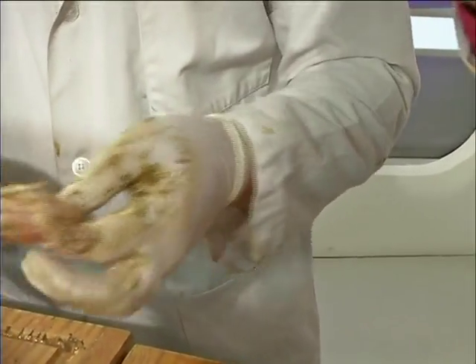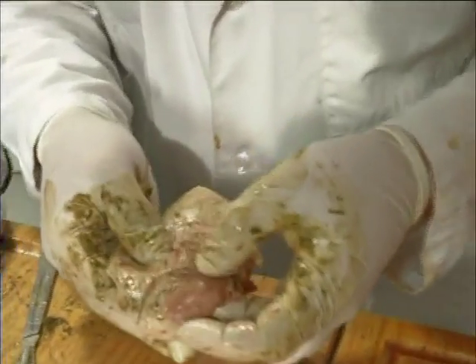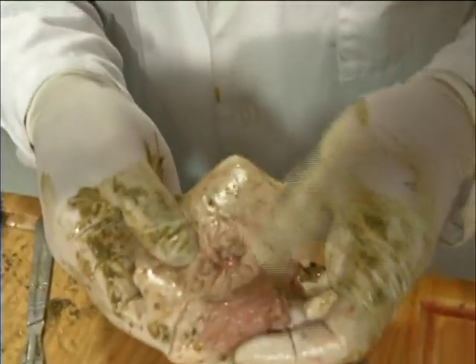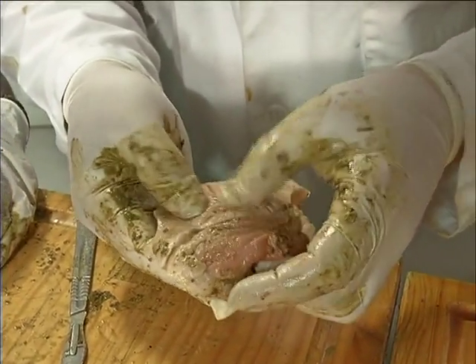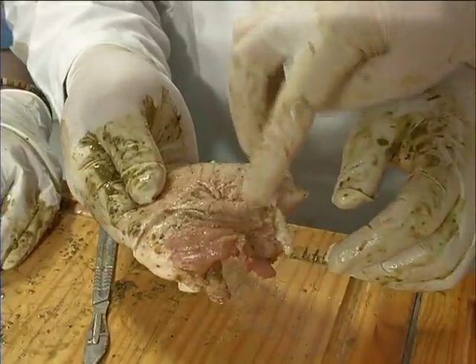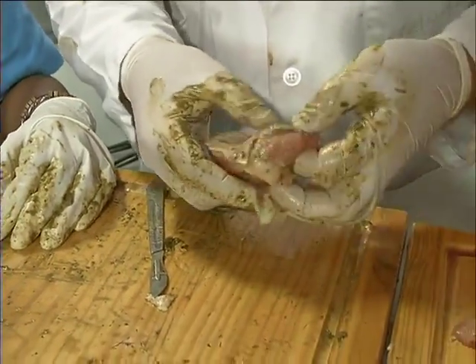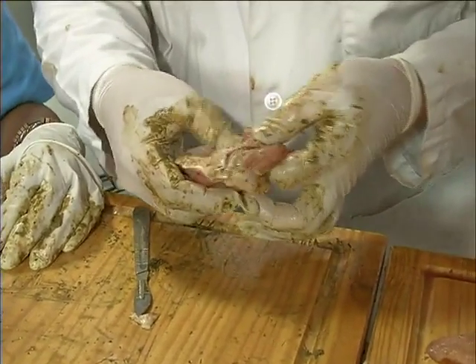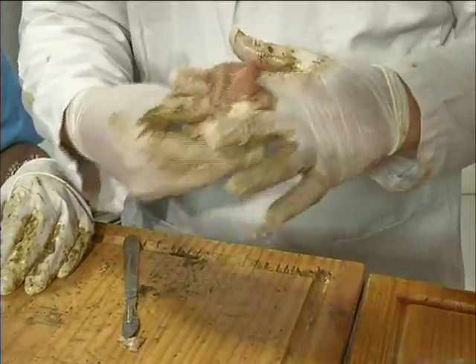Sphincter is a tight muscle. Look round here. If you have a look, you see it's got little grooves in it. That there's the sphincter. It's a round muscle. It's got those grooves so that it can stretch out and then back, because it can go big. I mean, it's got to push those pellets out. It's got to go nice and big. Look at that. Just so it stretches out nicely. But it's cool.